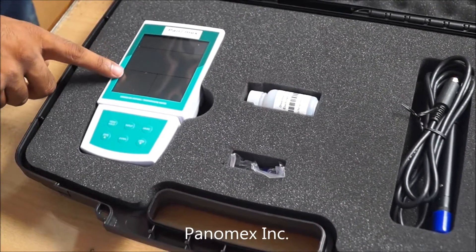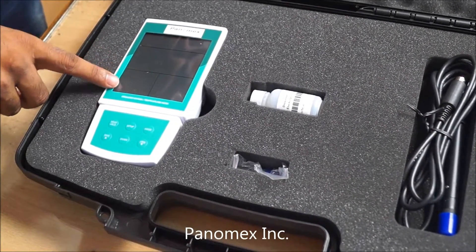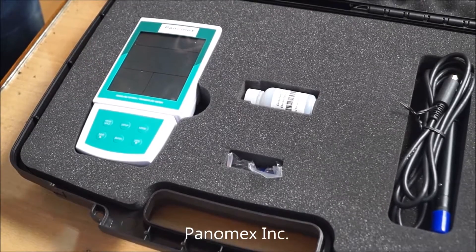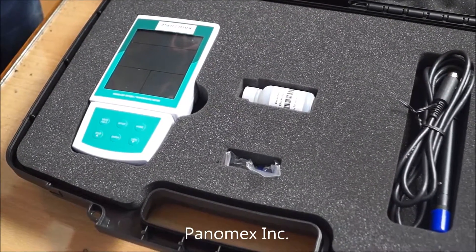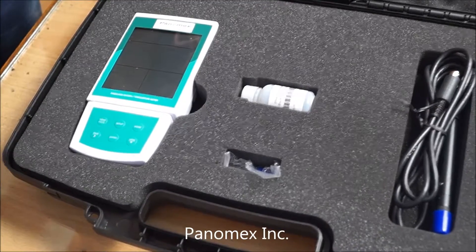This meter is used to measure dissolved oxygen in water, waste water, grind, and other liquids as well.